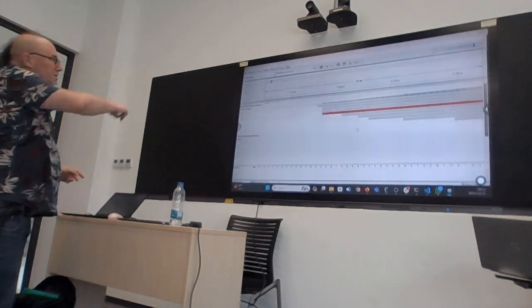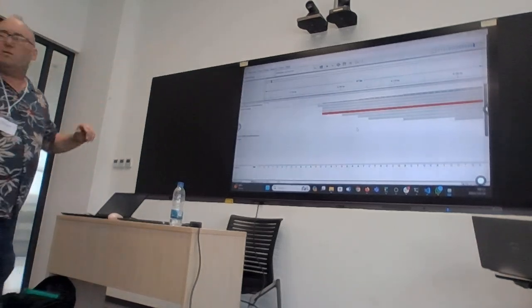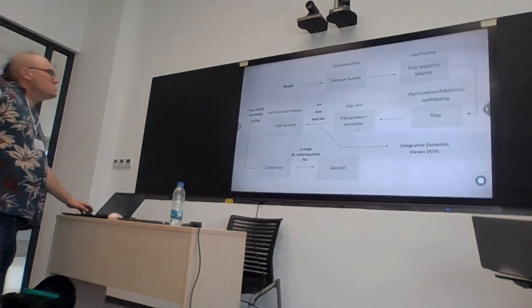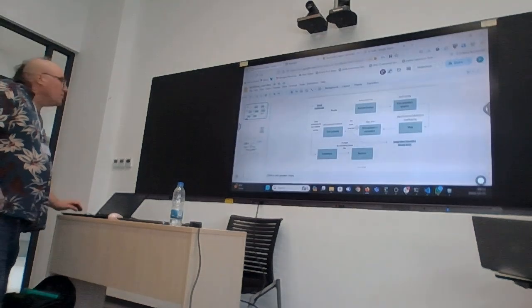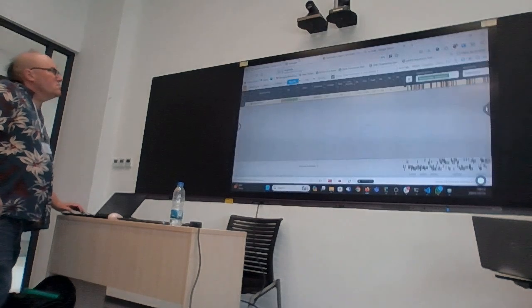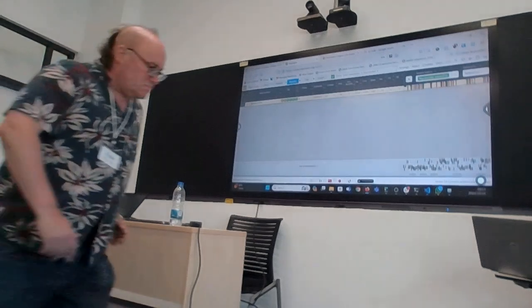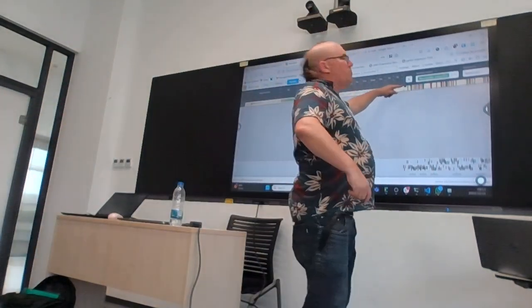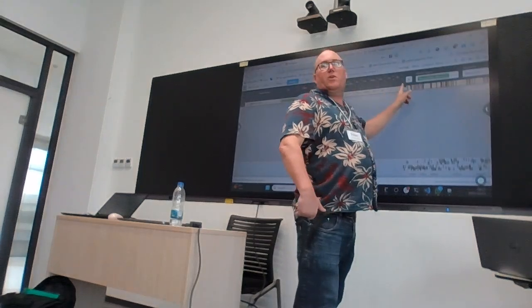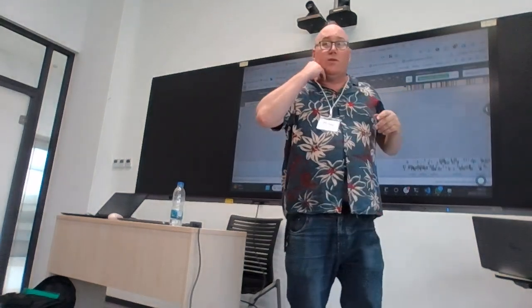And if we look at position 6,000, right? Remember, at the start of the genome, we have no data. That's this gray section over here. If you open the FASTA file, you'll see a bunch of Ns there.